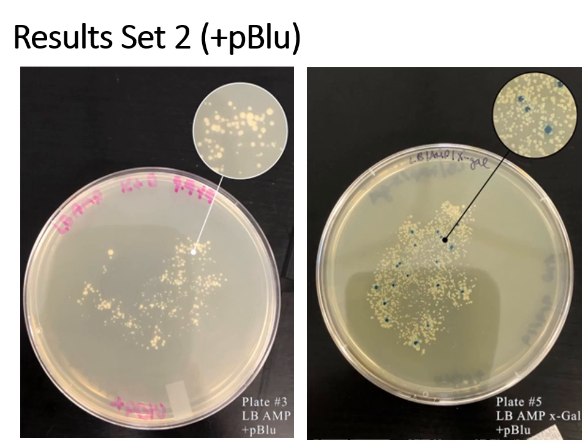You then have result set number 2. And both of these plates, I know they're a little blurry the way the students wrote on them and the way that I got the pictures, but notice both of these plates are plus P blue, okay? So both of them would be plus P blue and plus P blue. You already saw the plus P blue result on the first set, the one that I X'd out for set 1, that's actually part of set 2.